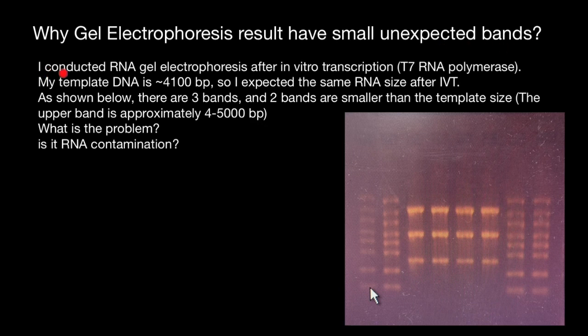Here is the problem statement. I conducted RNA gel electrophoresis after in vitro transcription (IVT) with T7 RNA polymerase. My template DNA is 4,100 base pairs, so I expected the same RNA size after IVT. As shown below, there are three bands and two bands are smaller than the template size. The upper band is approximately 4,000 to 5,000 base pairs.